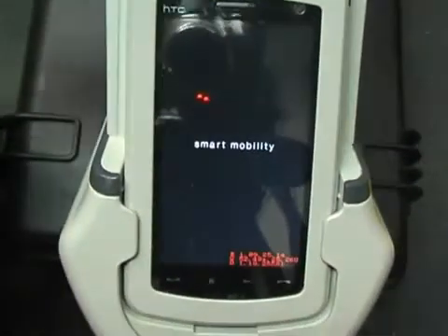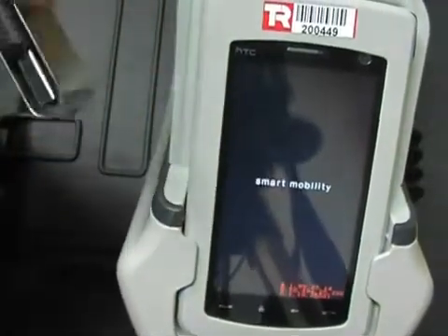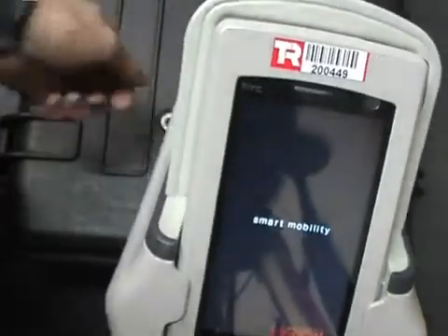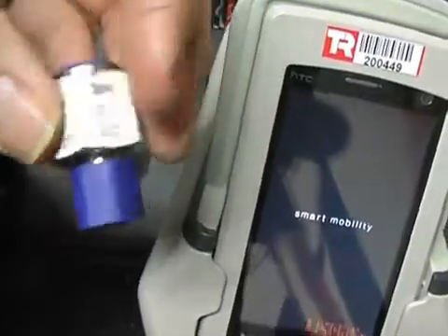The two test samples we're going to check out are the metal type of this cover on the memory stick, and the type of metal used in this piece here.